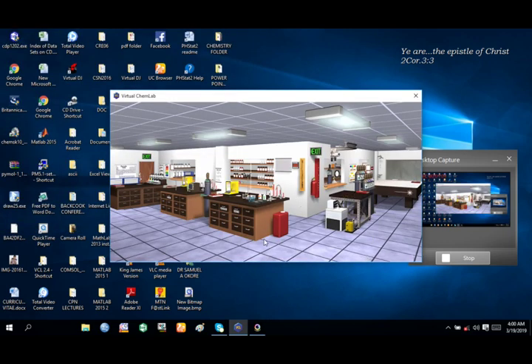In this laboratory, you have the titration lab, where you can conduct your titration experiments. We have about 5 major laboratories here. This is the calorimetric lab. You can see it by the movement of the cursor. You have the inorganic laboratory. We also have other labs like the gas laboratory, and the quantum laboratory at the extreme end. This is the quantum laboratory.